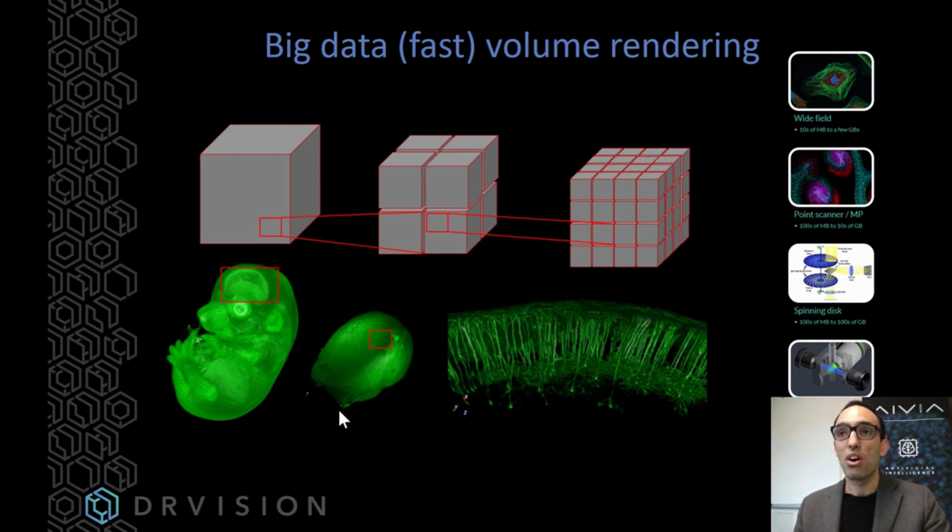So it uses all the information that it can gather, so all the hardware information and also the information about the image. And depending on a number of factors like image size, GPU type, and availability of memory, it will calculate what the shape and the number of blocks is. So that makes it really unique and a lot faster than other solutions out there. So that's the volume rendering reminder.